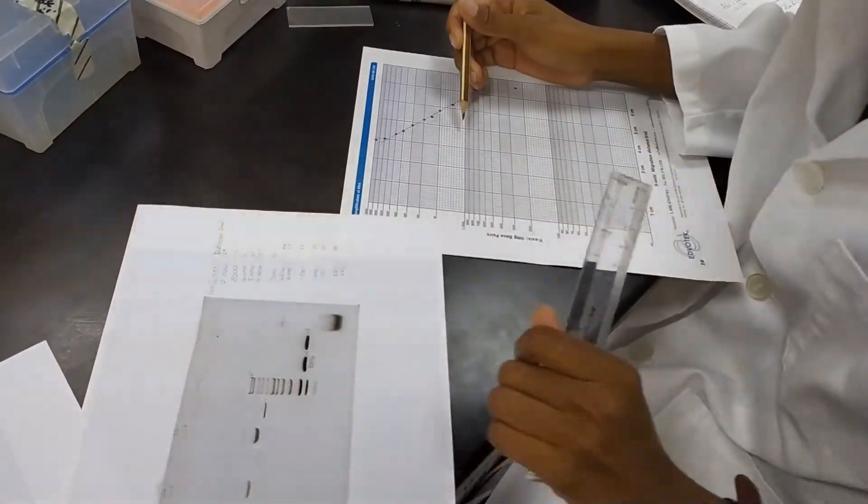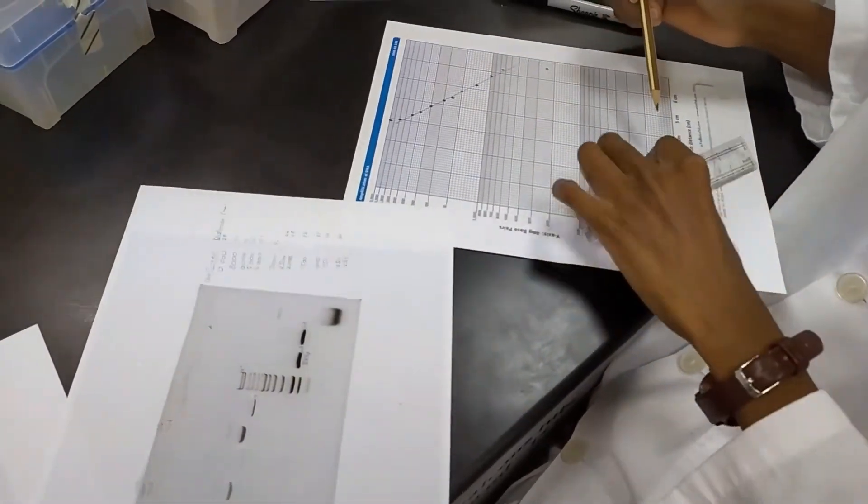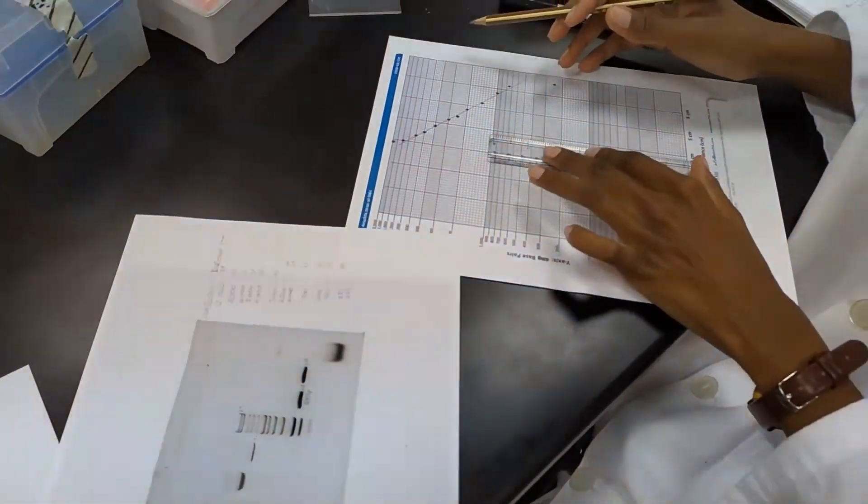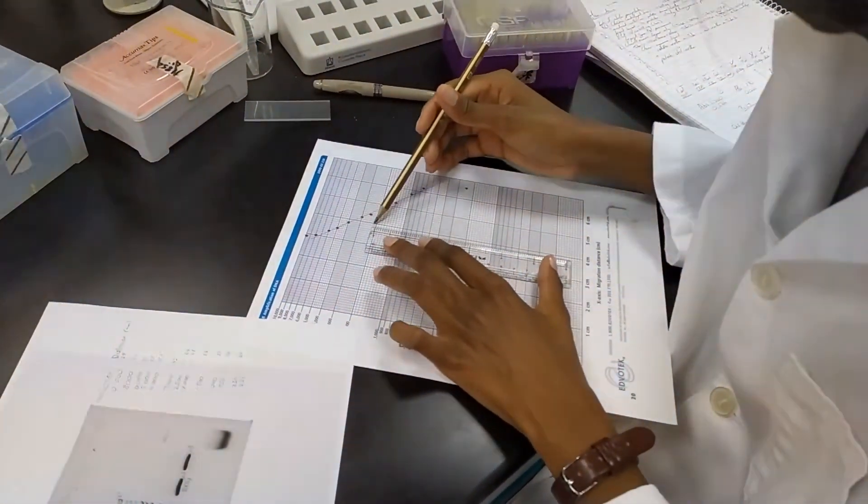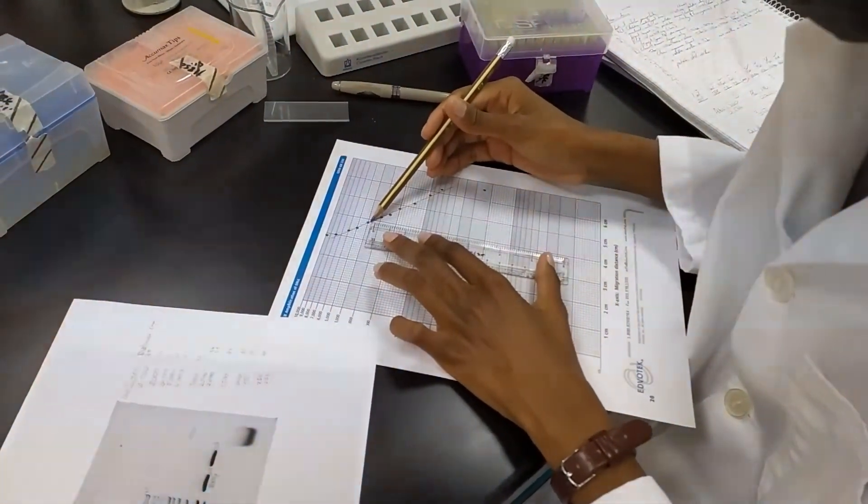So, what was the distance? 39. So, that's this one, which is going to go up to this one.